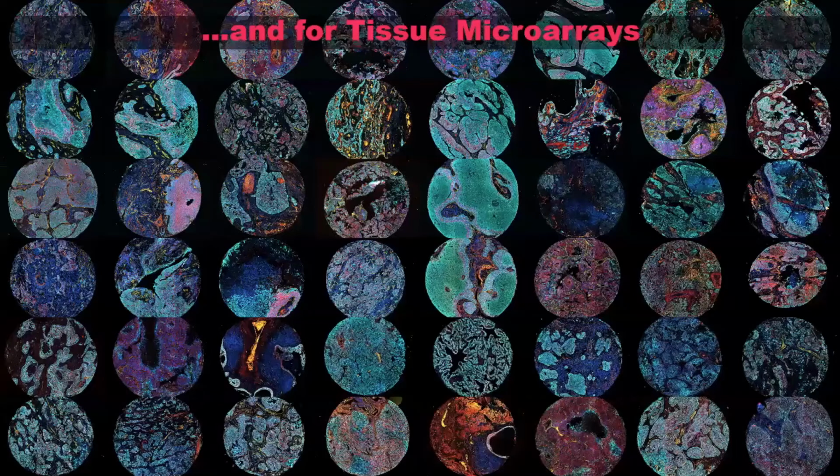You can also do tissue microarrays. You can see here, these are biopsies from lung tissue imaged in a Codex experiment. Now, this isn't the entire experiment. In total, what we did in this experiment was something like 54 cores. I'm showing a fraction of these, but it's just as easy to image tissue microarrays as it is to image a whole tissue. The only limitation, the only rule here, is you need to be able to fit them on your cover slip.